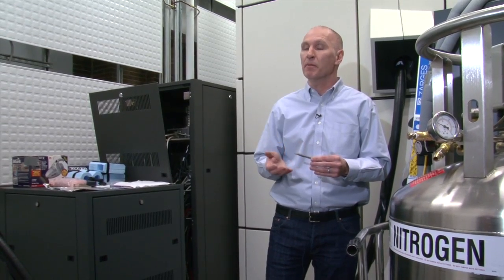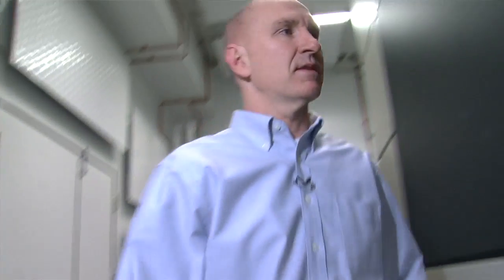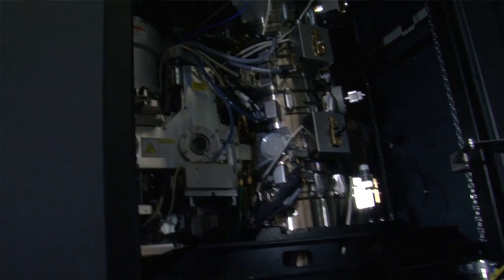Understanding structure at the atomic and molecular scale will allow us to design new materials based on what we've learned about their function using machines such as this. It allows investigators from across Montreal, from across the province, Canada, and even internationally, to come to this facility for electron microscopy research to have their scientific needs met at the atomic and molecular level.